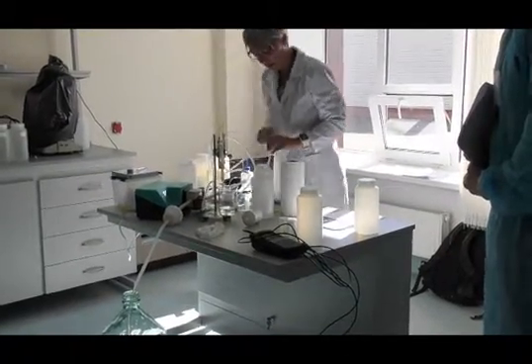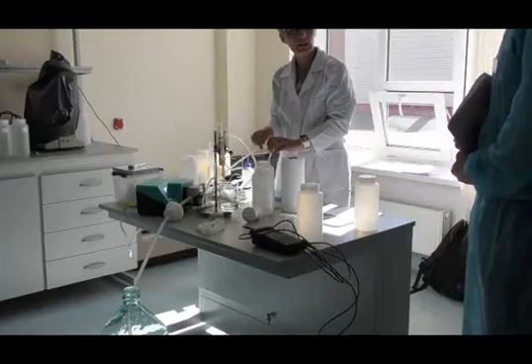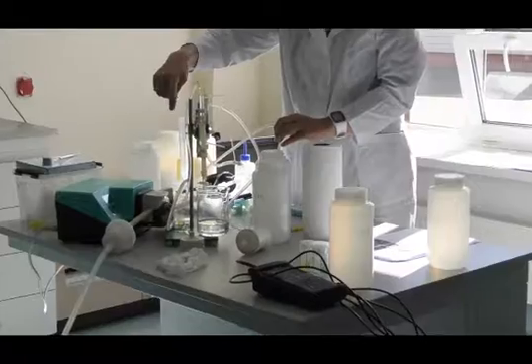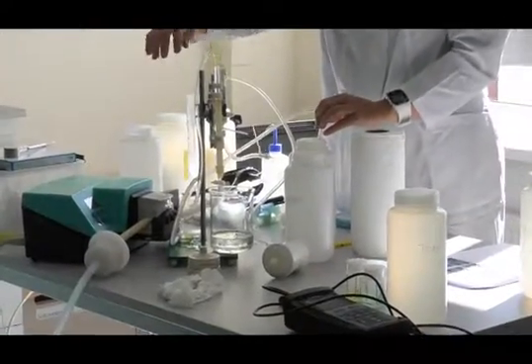So this is now the fraction that is less than 0.45 micrometer. The whole sample is going through the filter, and all the particles are left on the filter.